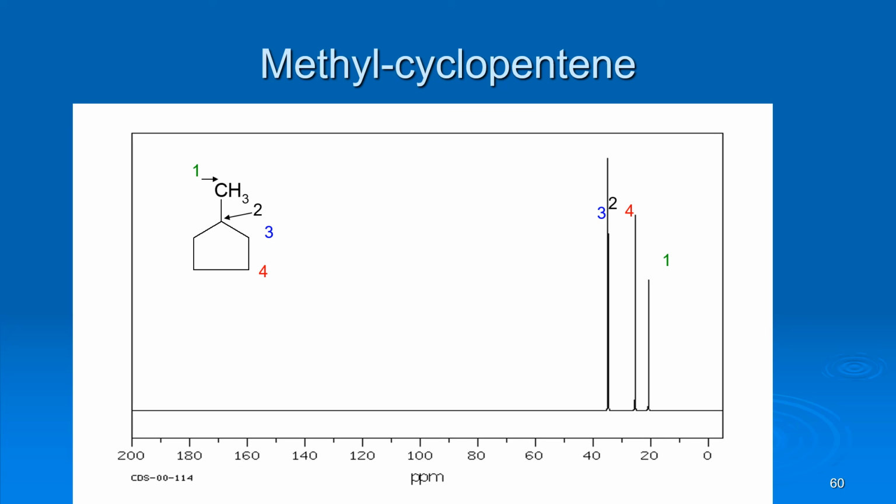And so this one is going to be a little bit hard to tell, but like we saw, there's 4 different carbons, and you can see 1, 2, 3, 4. I think the more bonds that you have, the further to the left you are. So definitely the CH3 is the furthest over here to the right. This would be carbon number 1. And I would say carbon number 2, now this one's tricky. Carbon number 2 is actually bonded to 3 other carbons, so I'm not sure which one of these 2 furthest left will be number 2.